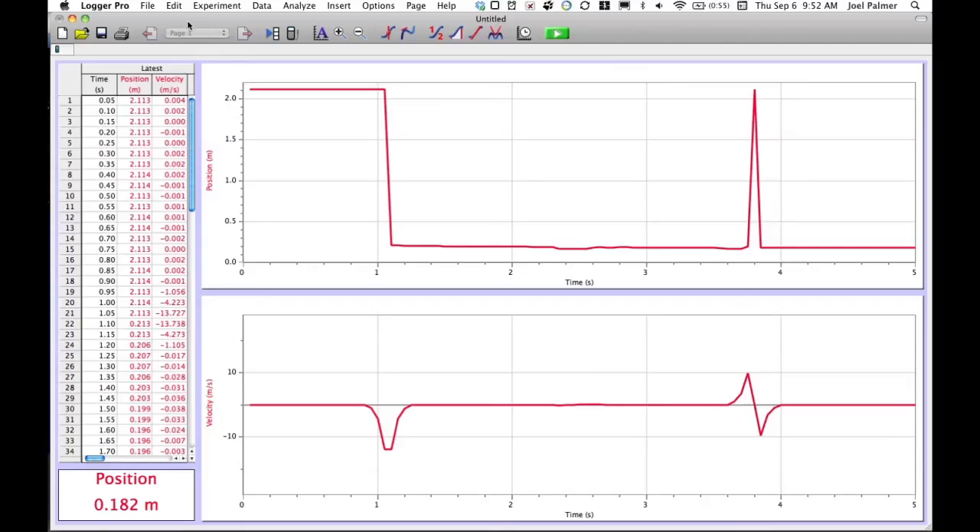I'd like to show you some features of the LoggerPro software so you can become familiar with the capability of this equipment. While I want to stress how simple it is to collect data, there are a lot of parameters we can change to determine how long we collect data, how many samples per minute, and that kind of thing. What you see below the gray toolbar is referred to as a page. You can actually have multiple pages in an experiment so you can have different data collection setups on each — a nice feature if you have an ongoing experiment with different types of data.